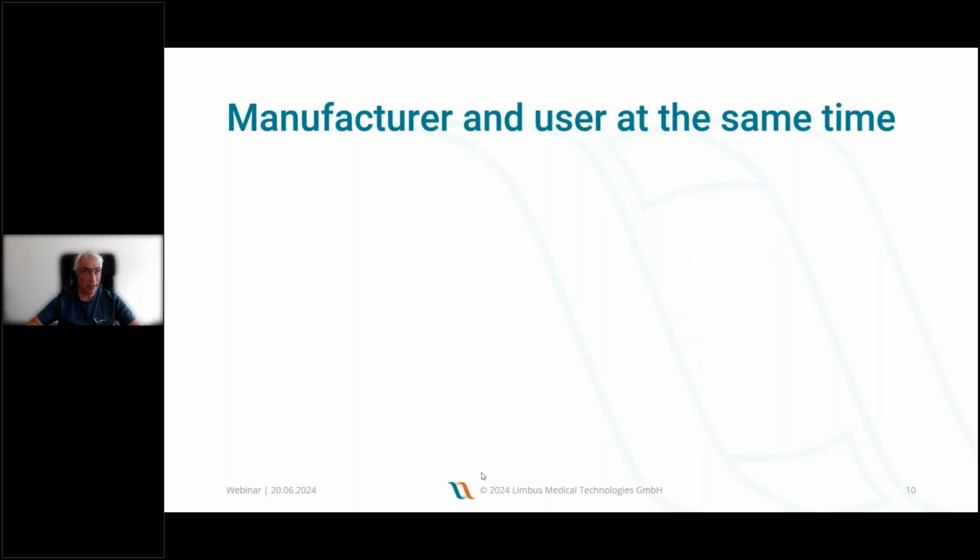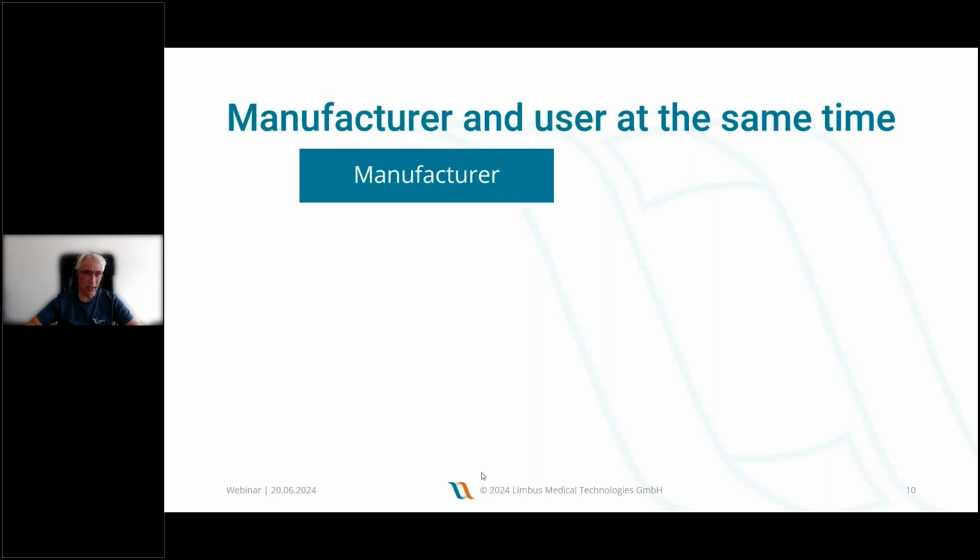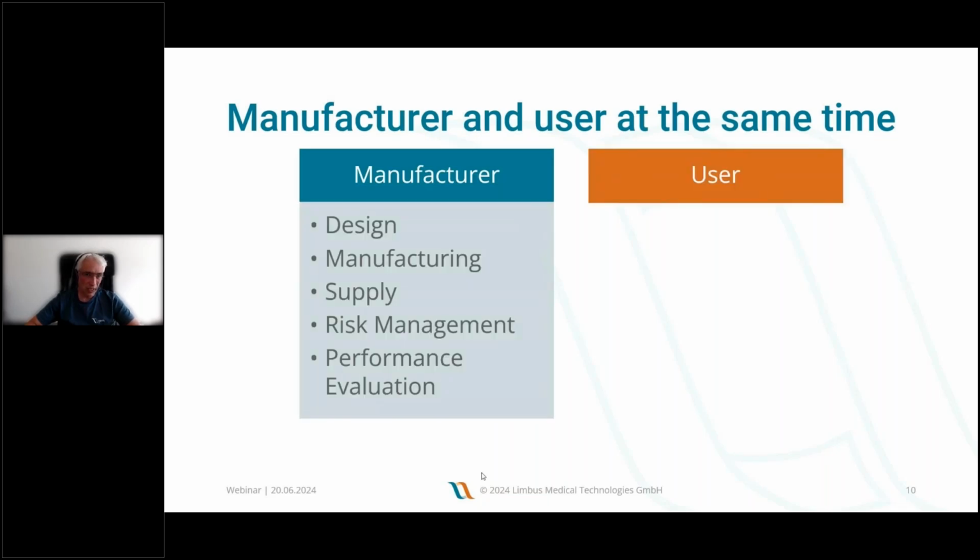Now I understand that this is still a new situation for laboratories, because they have a dual role. Under IVDR, they're both manufacturer and user of medical devices. And this is a difficult situation. You probably have to keep these two worlds a little separate, because it makes your life a little easier if you think in these two terms. So you are a manufacturer and you are a user, and the responsibilities are quite different.